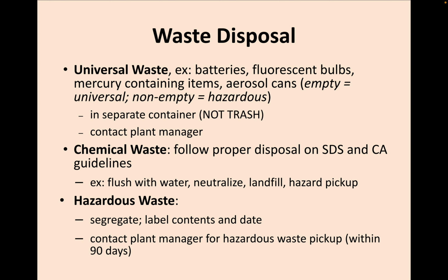Hazardous waste, of course, requires more precautions and needs to be held separately for pickup by OHS. If you ever forget the procedure, contact the school's chemical safety coordinator.